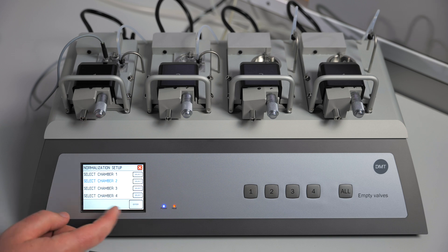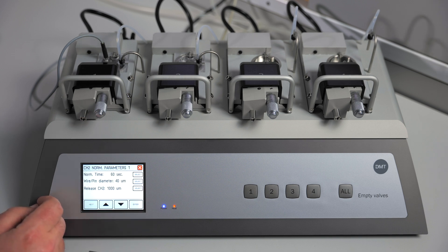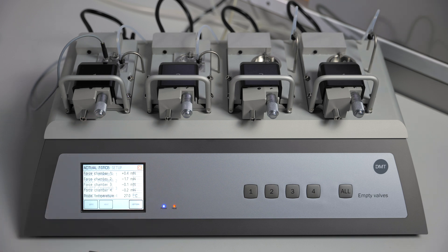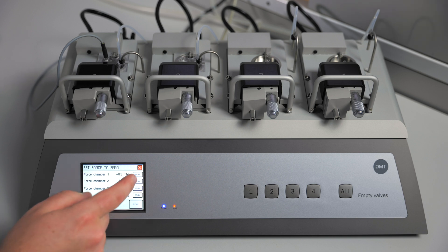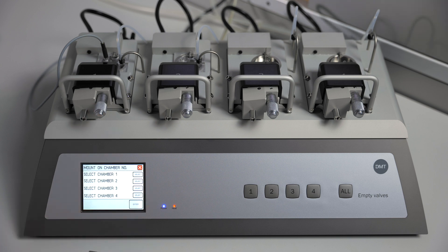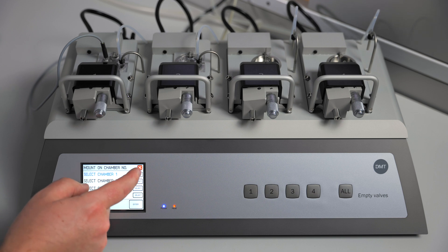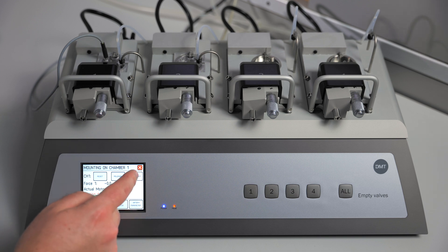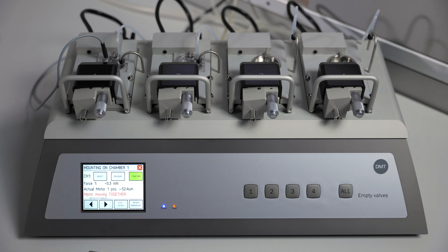We will do the same thing for the second channel, which also has a mouse mesenteric artery loaded. When you are ready to begin your normalization, you will first need to zero the channel that you will be normalizing. Then go into the settings menu and mounting artery. Select the channel you will be normalizing, move the jaws together, and then press reset.